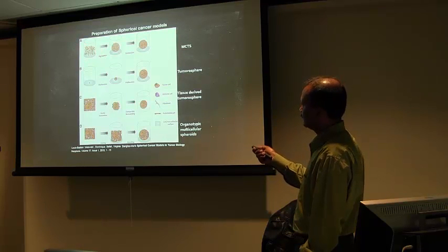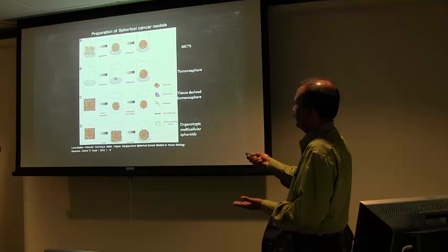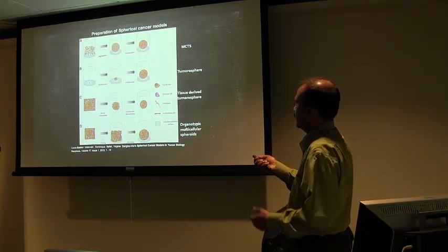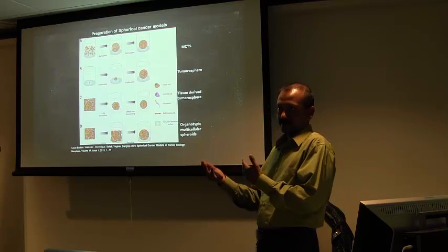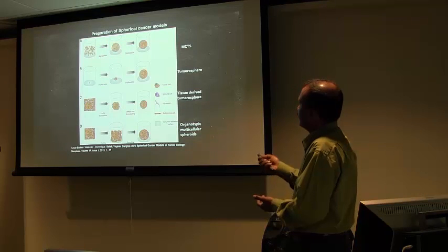So you have the tumor cells or cancer cells, and then you create a situation where they cannot attach to the surface. So this is actually a very less adherent surface that the cells cannot attach to. And sometimes you also use agitation or rotating flasks, so you don't allow the cells to settle and just attach. So in that case, they form the spheroid. This is called multicellular tumor spheroid.